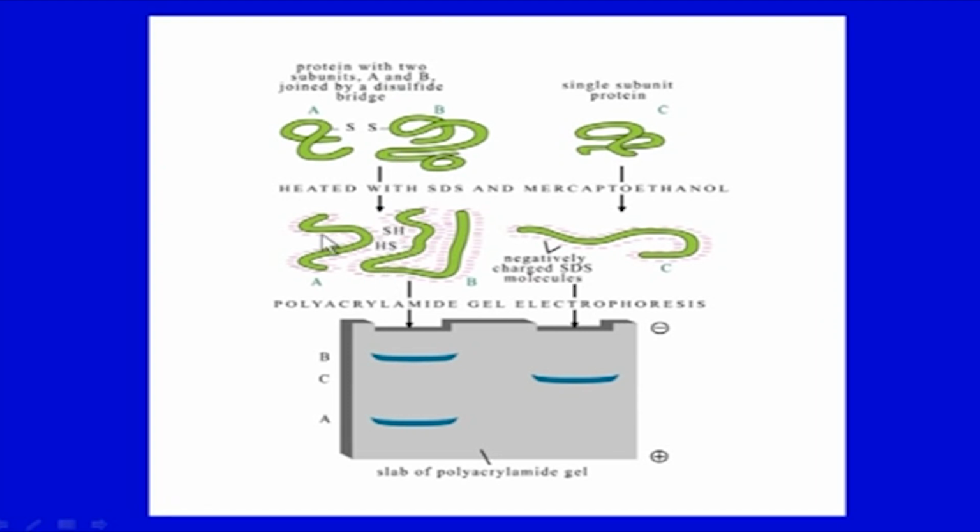It is a reducing agent, so it reduces them. Then a single protein, though made of two polypeptide chains, will be seen as two separate bands in a reducing gel. To know whether it is a single protein, you can always run non-reducing gels also. In non-reducing gels, these disulfide bridges will not be broken, as mercaptoethanol will not be included in the sample buffer, and a single band could be obtained.